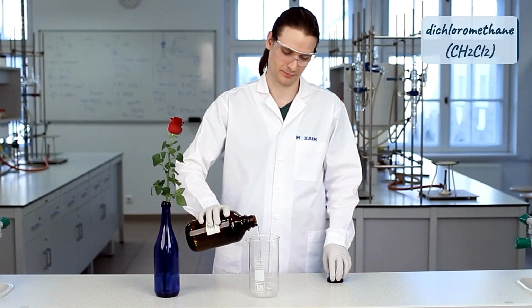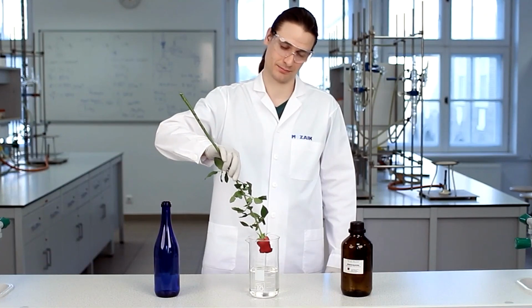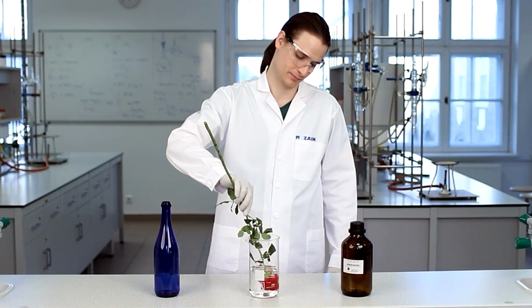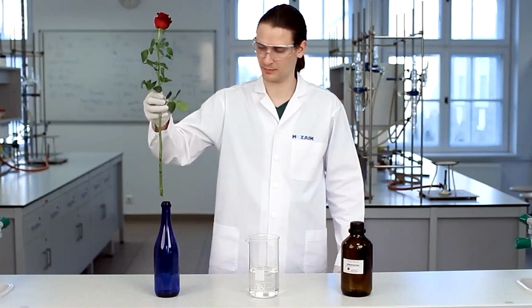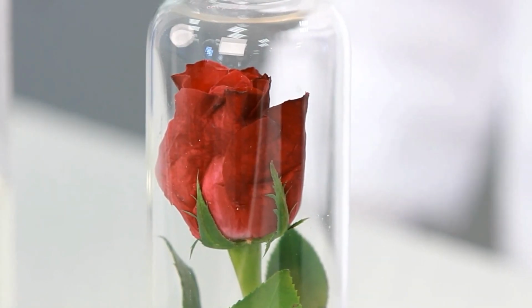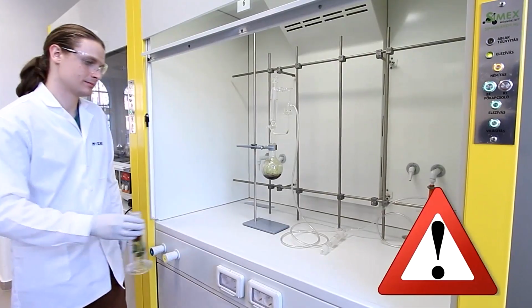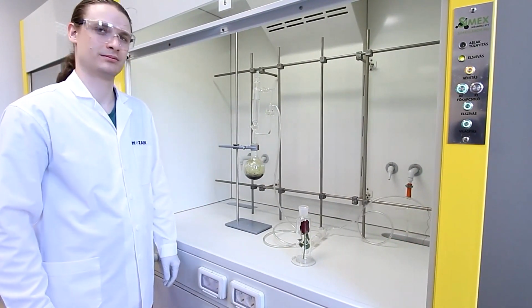Next, we will immerse the rose into a solvent to dissolve the protective wax layer covering the surface of the petals. The chlorine gas can thus easily penetrate the rose petals. Chlorine gas is highly toxic, so the experiment must be performed in a fume cupboard.